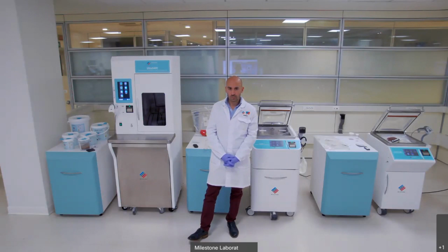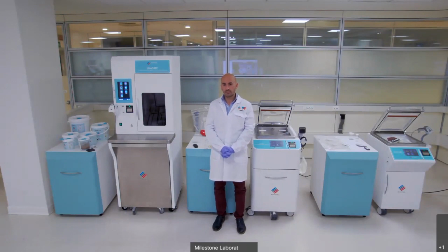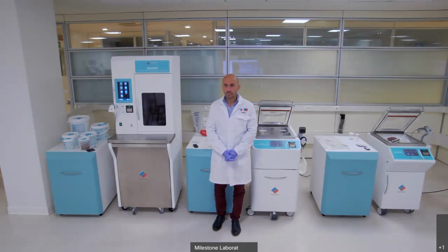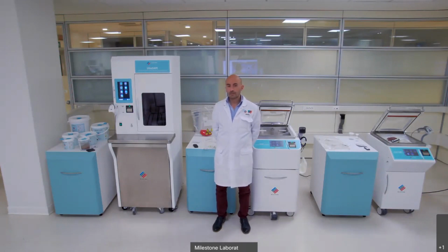One final question for you again, Marco. Is it possible to archive bags for 2 weeks without formalin? Yes, indeed. We have users that, after the primary fixation, with the tissue soaked with formalin, vacuum pack the tissue in vacuum bags without adding formalin. And for longer than 2 weeks, we also have publications or studies done on that. Tissue can be preserved for archiving, and the advantage is that the disposal happens like normal biohazard waste instead of decanting the formalin out from the container.